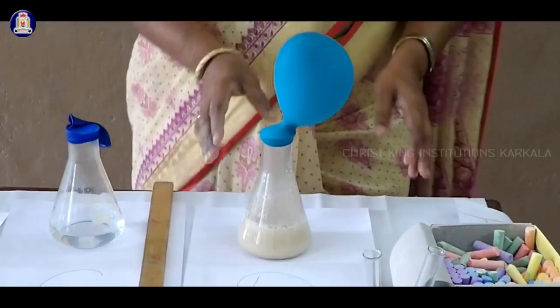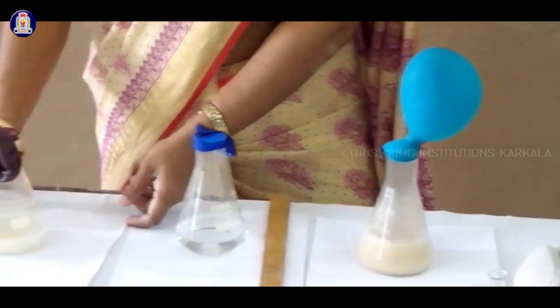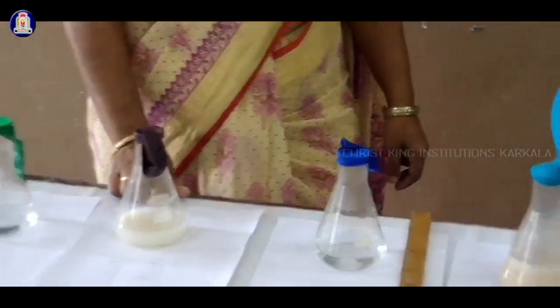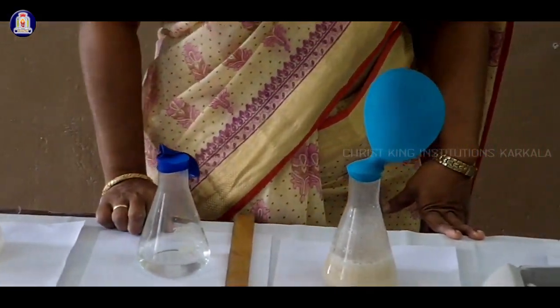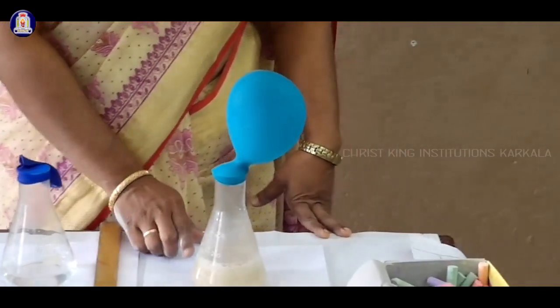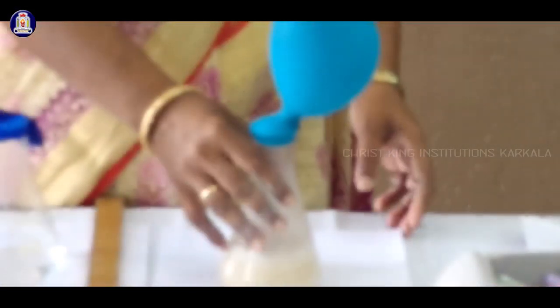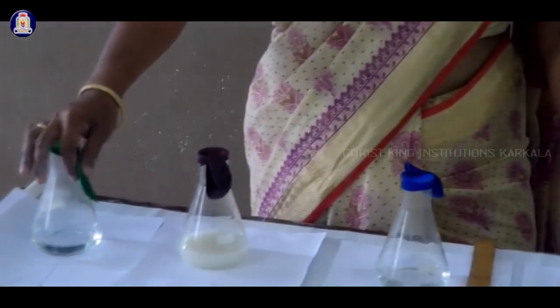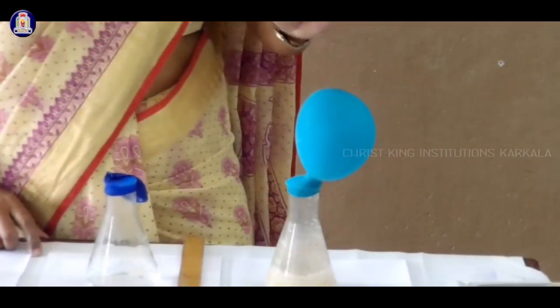We have already conducted this experiment. I kept it for 3 to 4 hours. What is the result out of the 4? The first one is only boiling water, the second is lukewarm water with the yeast, the third is lukewarm water with the sugar, and in the fourth I mixed sugar, yeast and lukewarm water and fitted a balloon. Now you can observe the result clearly. There is no rise of balloons in the first 3, and in the fourth one the balloon is raised.